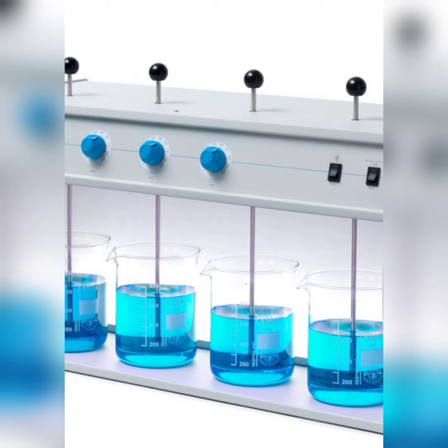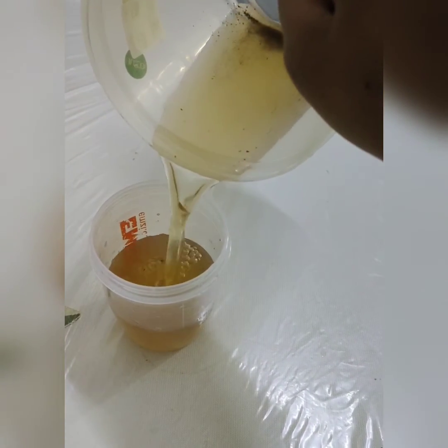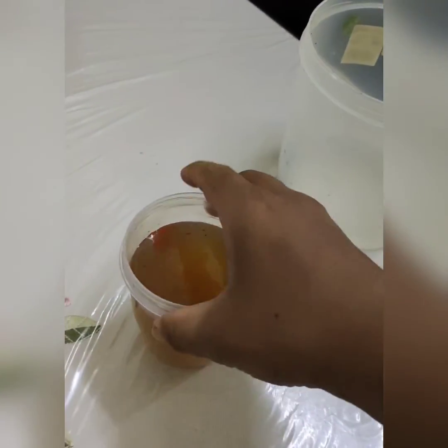Assalamualaikum, my name is Amir Hamzah. My part is the procedure of the jar test, and these are the steps. Firstly, we bring one water sample from the river to the laboratory for the experiment. For the first step, we take the water and put it in the 1000 milliliter bottle, and we use 6 beakers.